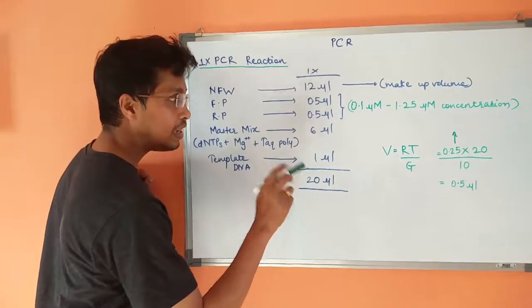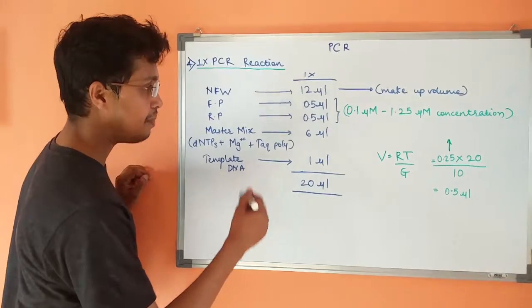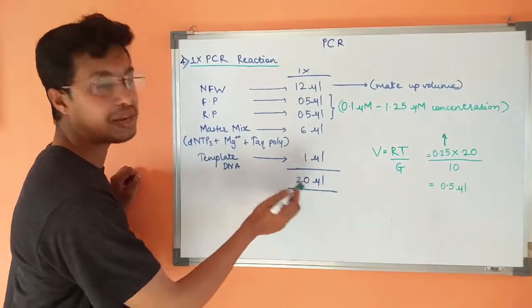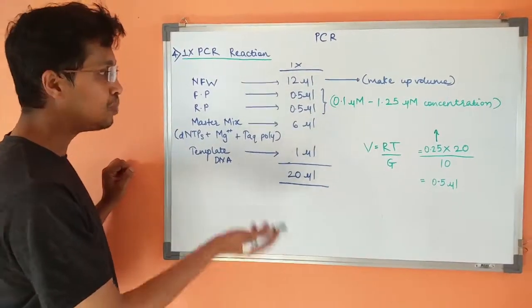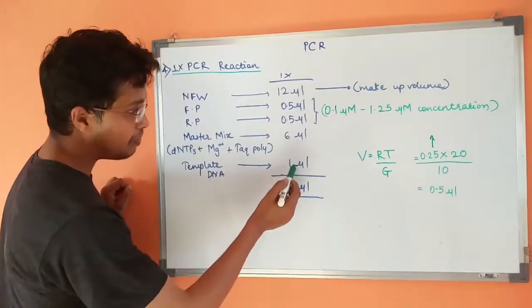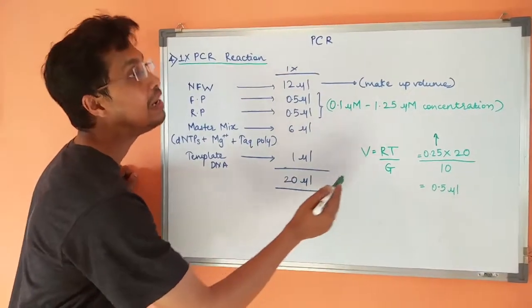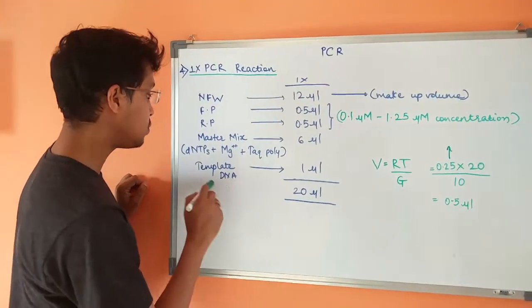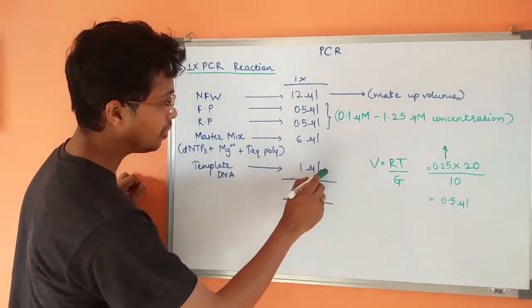Master mix, it is prescribed in that particular kit which I am having, that I should add 6 µL of volume for a 20 µL reaction, which is already given to me. I cannot change that. Then template DNA, I can add 1 µL depending on it comprising a concentration of 50 to 250 ng. I am going to add 1 µL.